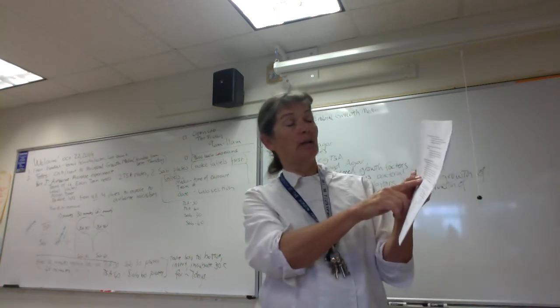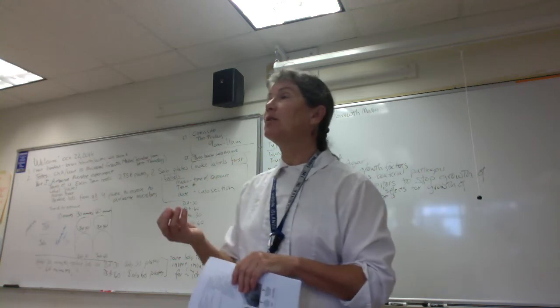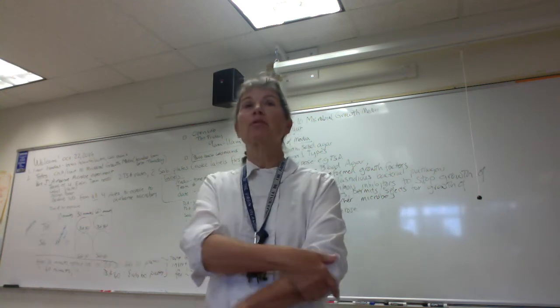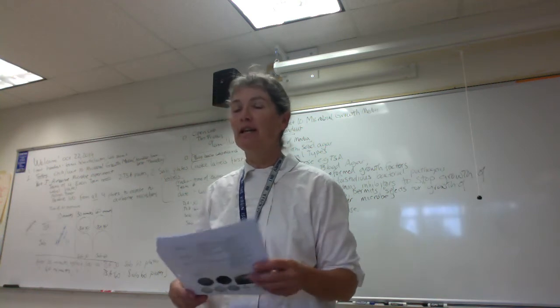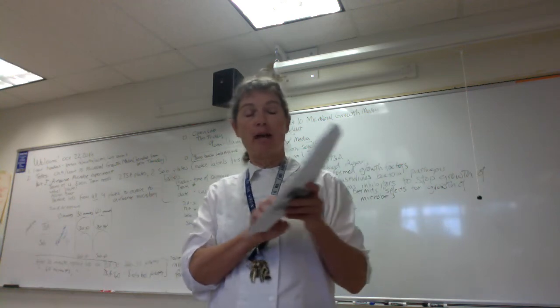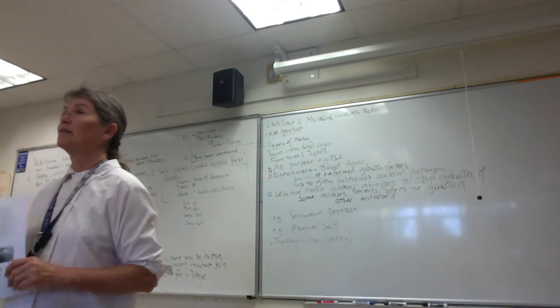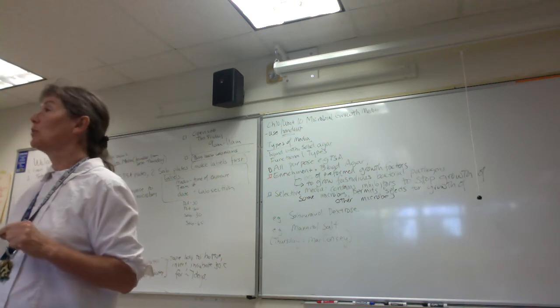So now, folks, we're going down to the next one, selective. So selective media is media that includes some substance or substances that inhibit, stop the growth of certain groups of microbes, and thus permit or select for the growth of other microbes. It's a little bit confusing initially. So, for example, folks, let's look at the Sabouraud's dextrose media that we're using. Sabouraud's dextrose media is selective for fungi. Okay, so on your SAB plates, we should see primarily yeasts and molds growing.